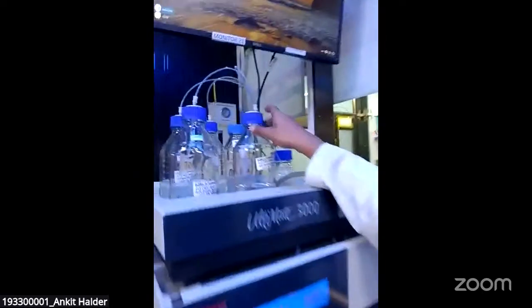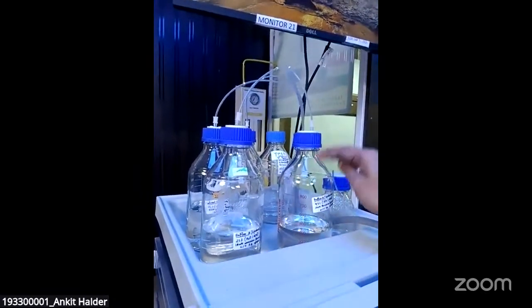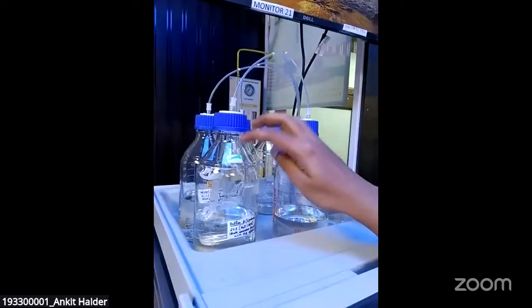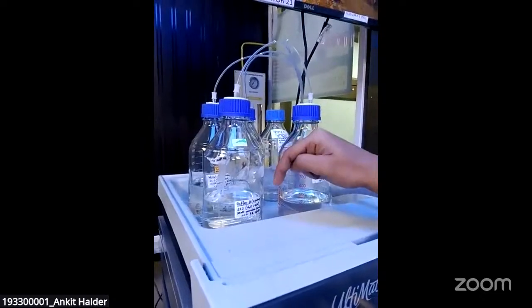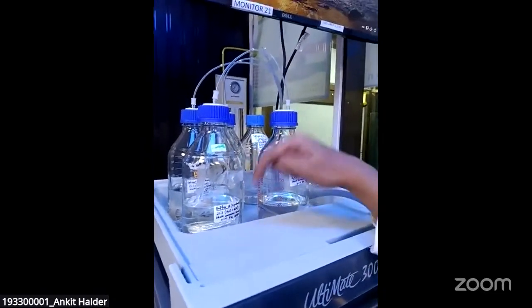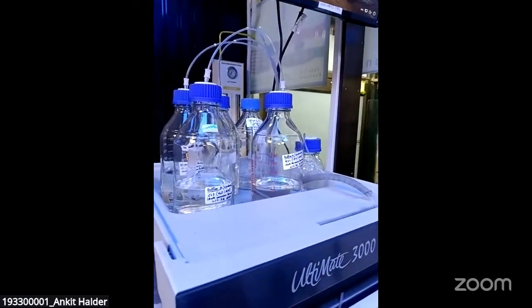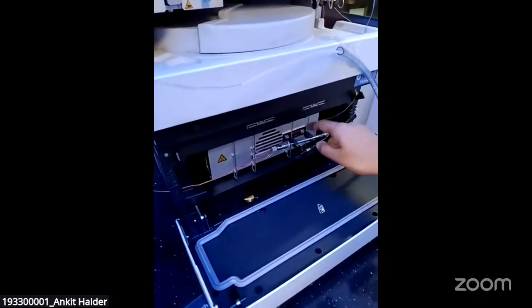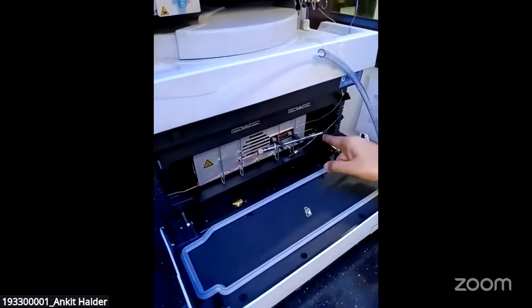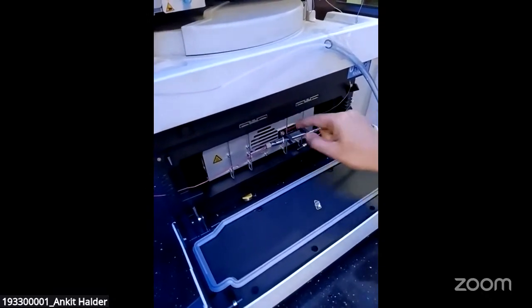These are our solvent systems. This is the Ultimate 3000 HPLC, which consists of four pumps. We generally use two solvents, A and B. Since we try to make a hydrophobic gradient, we need different solvents to make a gradient which passes through the column. When the sample comes to the column, there is the stationary phase, and the samples will bind to this material. For example, this is the C18 material, so the hydrophobic part of the molecule will bind to the column.